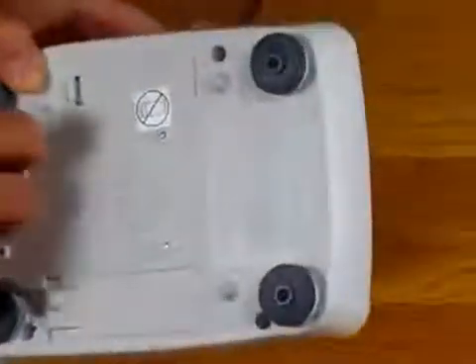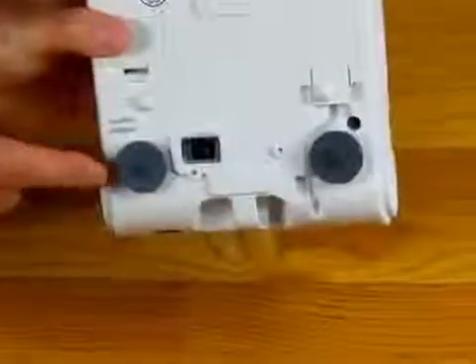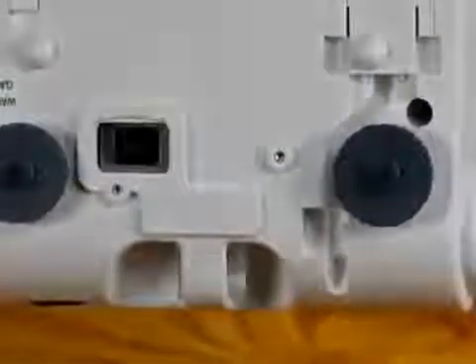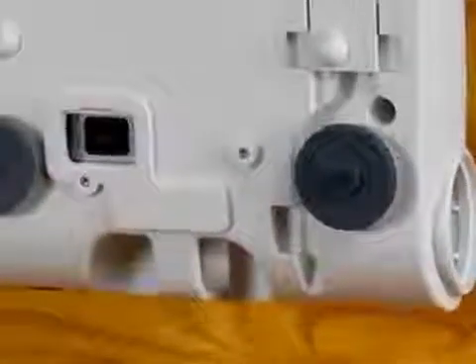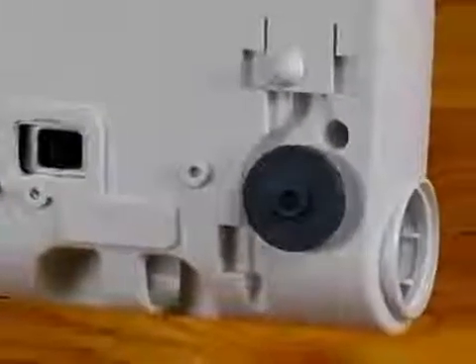Another nice feature is this little compartment here, which is the underhook. So you could weigh either magnetic material or hot material on this balance. What one would do is hang a wire. A wire is best if it doesn't hold any static, or you can use a string. I wouldn't recommend a string. I would still go with a wire.